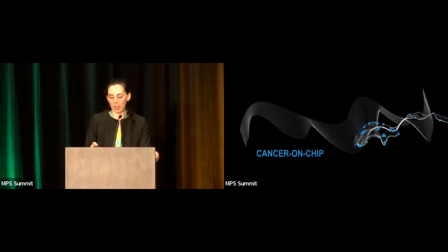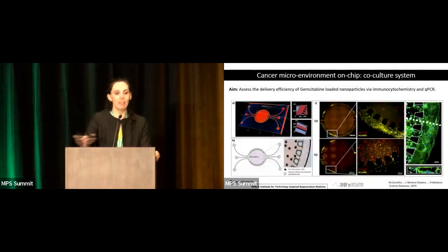So moving on to the next case study. In this example, I'm going to emphasize how the geometry can also play an instructive role. And again, here it's really looking at the question you want to address. So the model I'm going to talk about, okay, is a colon cancer model. Cancer model on the colon, actually.